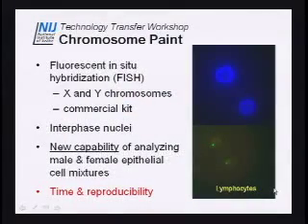If you see at the top, y'all got to see the DAPI stain today where your nuclei are covered. Here are the same two cells at the bottom. They happen to be both male cells. If you look in there, you see the bright green. The bright green, that's your Y chromosome. And up here is the red dot. That is the X chromosome. And on here, here's your Y, and here's your X.